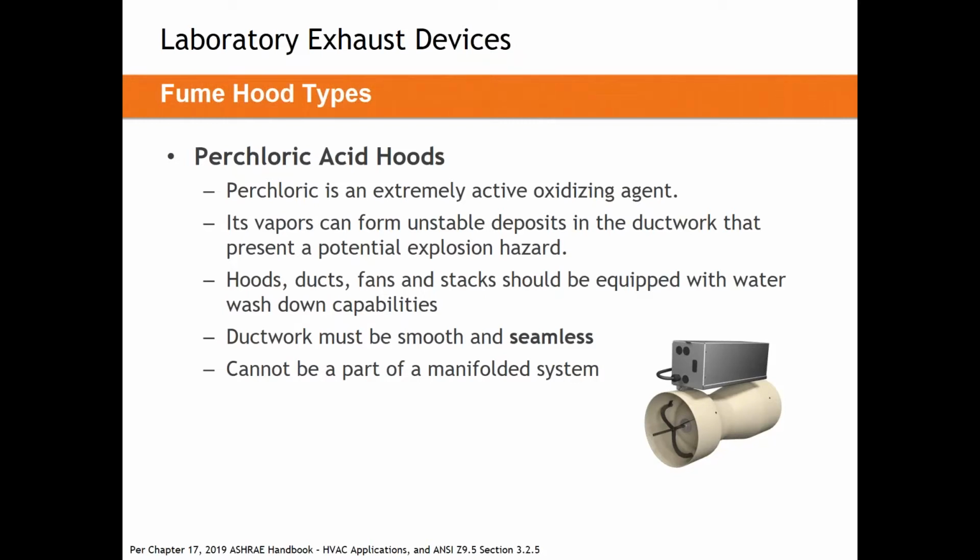So perchloric, like I said, gets this separate part in all these standards to describe how we need to build these systems. And what the standards state are these last 3 points. Hoods, ducts, fans, and stacks should be equipped with water washdown capabilities. Ductwork must be smooth and seamless, and these cannot be part of a manifolded system. It's those last 2 points that are extremely important to us today. They must be smooth and seamless, and they can't be part of a manifolded system.